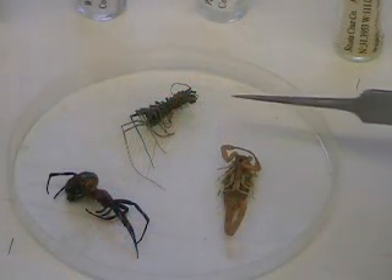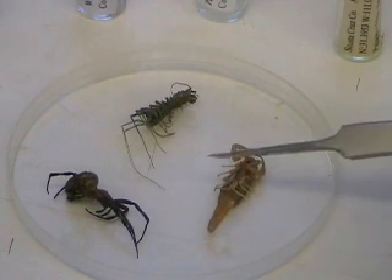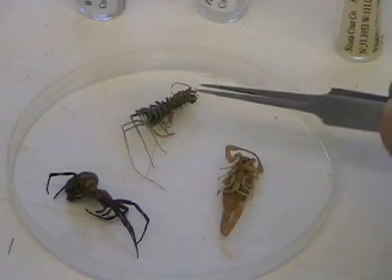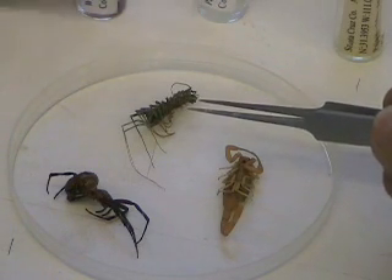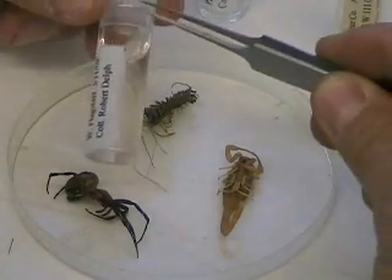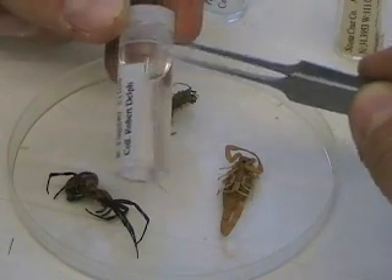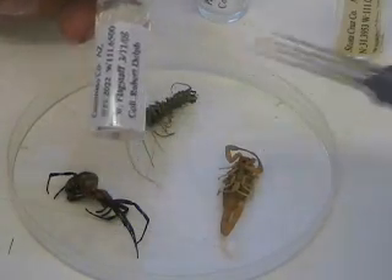Non-insect specimens — specifically centipedes, scorpions, spiders, any arthropod that's not an insect, even crustaceans such as shrimp and lobster — usually go in ethanol for proper preservation. We prefer to use one dram vials or two dram vials with snap caps to prevent liquid from leaking out of the container. And we also have a label that is in the vial with the specimen.